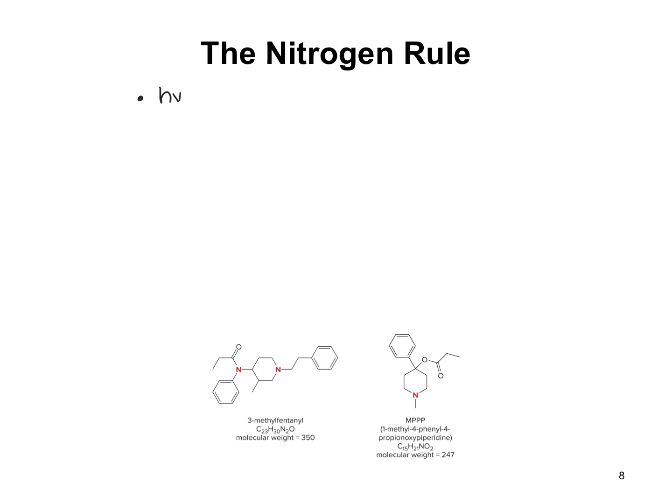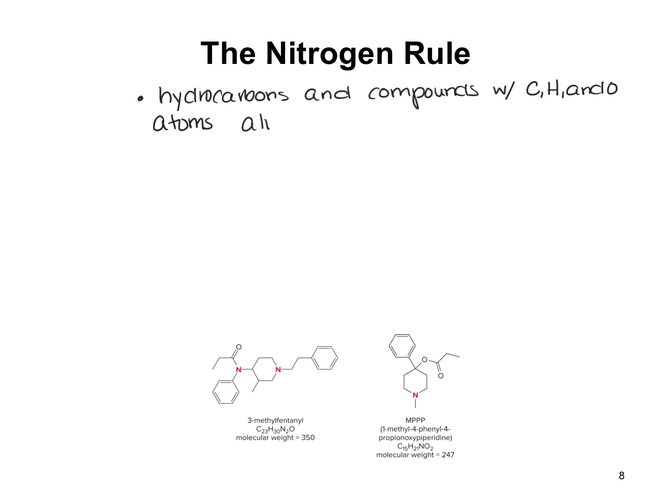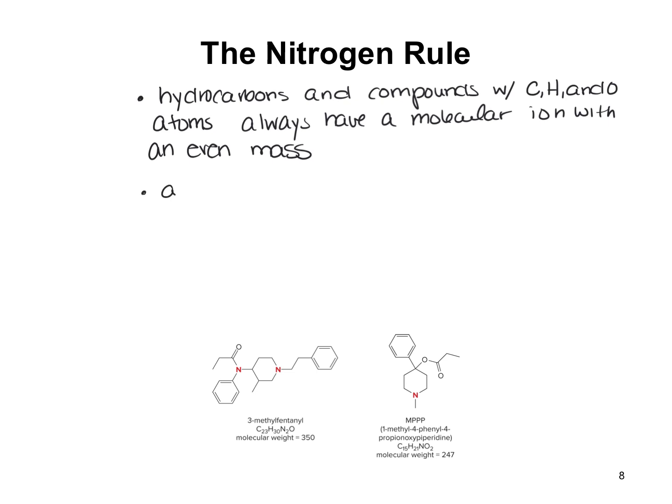So, hydrocarbons and compounds with just carbon, hydrogen, and oxygen always have a molecular ion with an even mass.